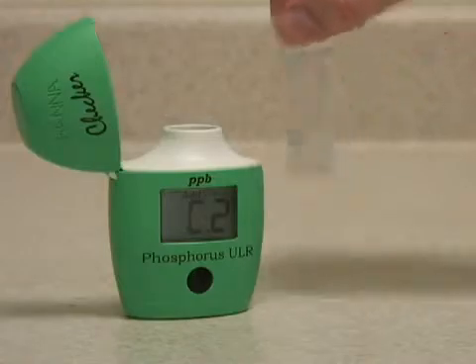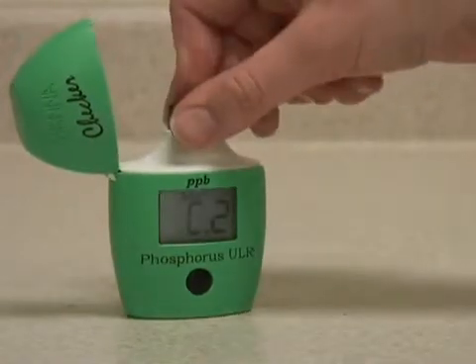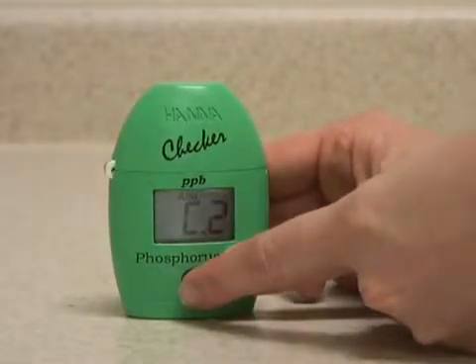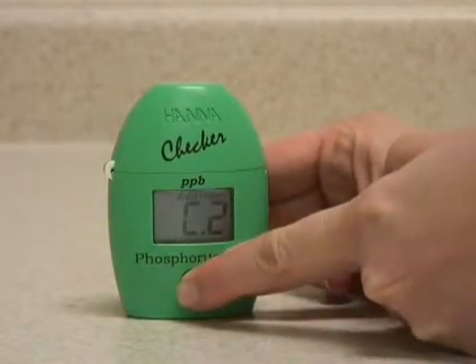Once the reagent is mostly dissolved, you can insert the vial back in the meter, close the cap, and press and hold the button to activate the read time function.